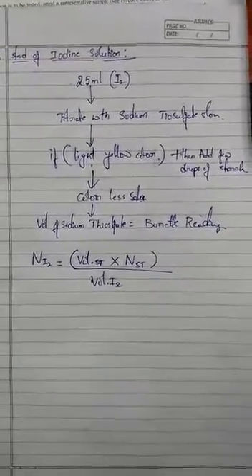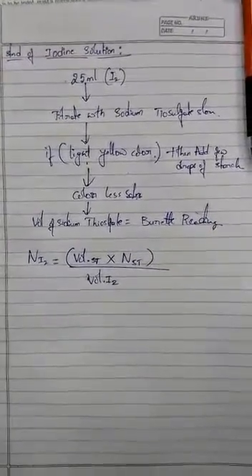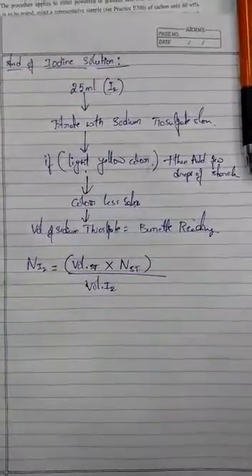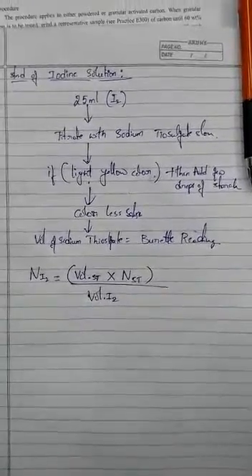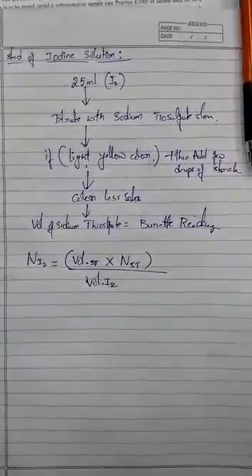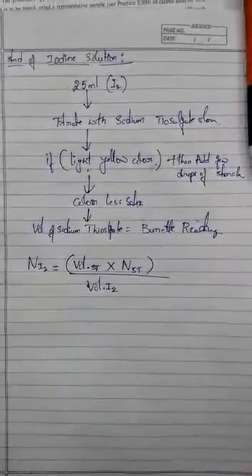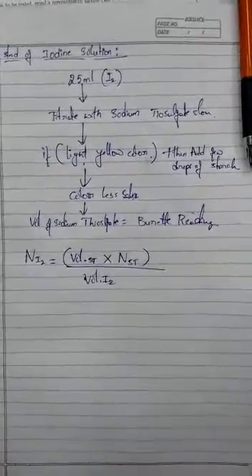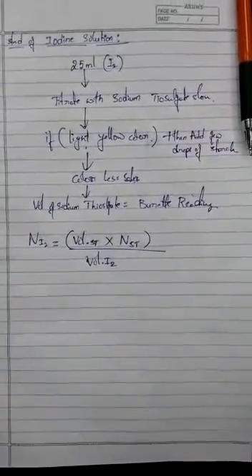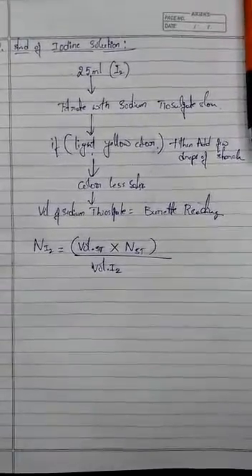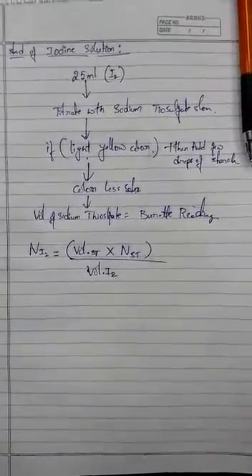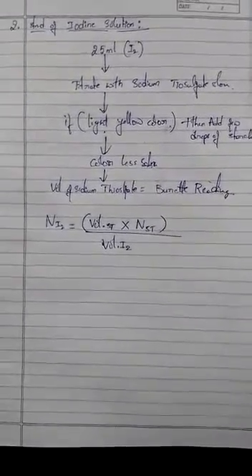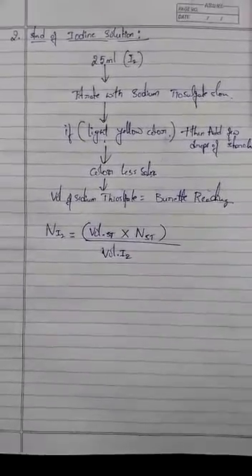Now we will start doing iodine solution standardization. It is a very simple procedure. Add 25 ml of iodine into the conical flask and titrate against sodium thiosulfate solution. Once the solution inside the conical flask turns light yellow color, then add few drops of starch, then do the titration again till the solution becomes colorless. The volume of sodium thiosulfate is equal to the burette reading we get.